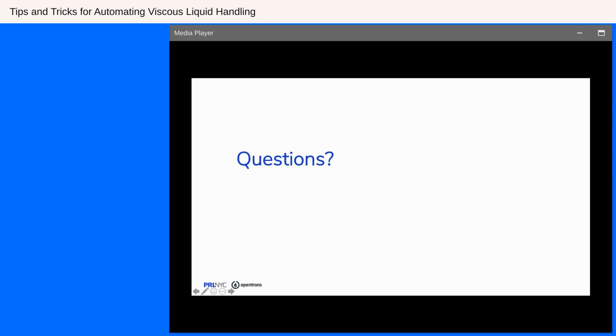Sure. The touch tip function is generally used when the liquid is still sticking to the tip, like the orifice of the tip. A good way to try to remove these kinds of liquid droplets is using touch tips.